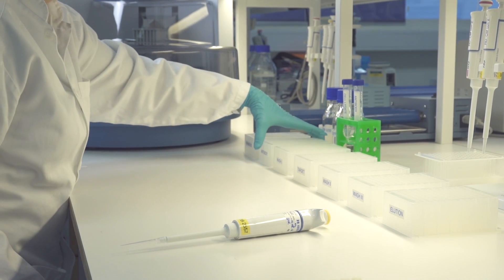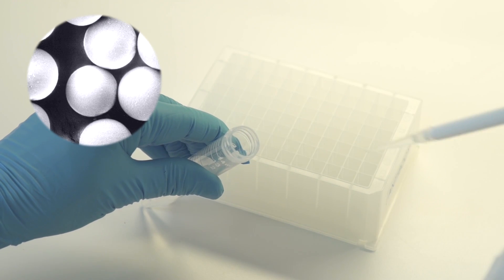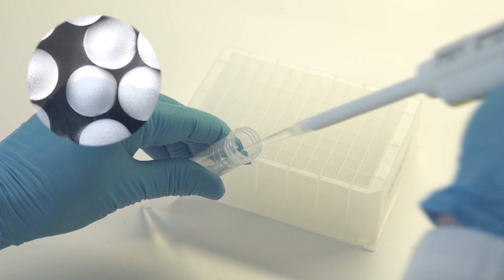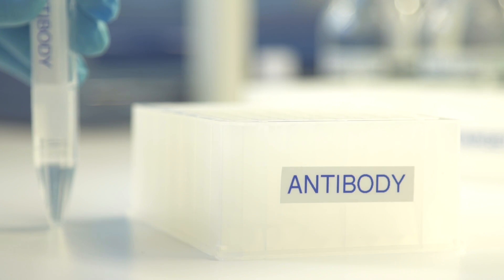The second plate is loaded with antibodies for target capture. Due to the smooth surface of the beads, antibody consumption is very low, thereby minimizing cost while exploiting the full capture potential of the antibody. Typically, less than 10 micrograms of antibodies are used per 50 microliters of DynaBeads for each sample.